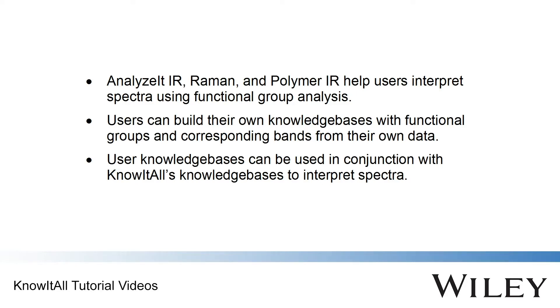In this demo movie, we will show how to build and use a knowledge base. We will show only Analyze-It-IR in this example, since the process is the same in the other applications.